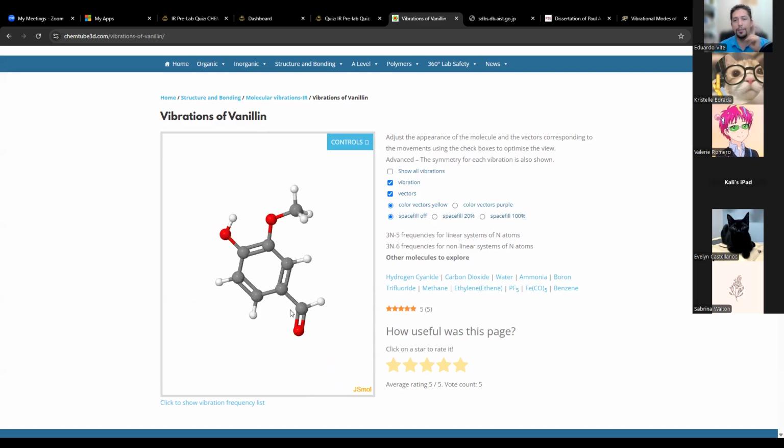But my professor said the benzene ring is a functional group. Yes, technically it is, right? But it's clearly the main structure, so I don't think it's a functional group. I think it's the actual main chain itself. Again, every chemist varies. Listen to your professor. Whatever they say is correct.